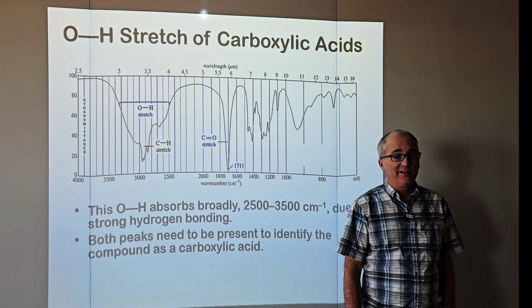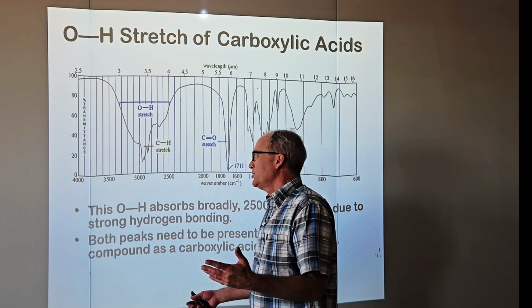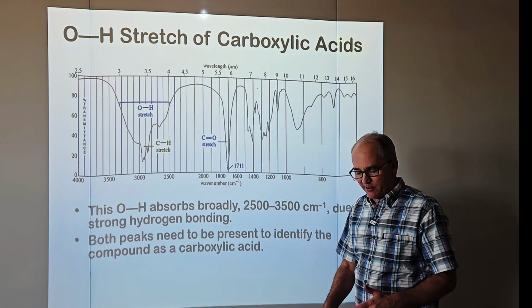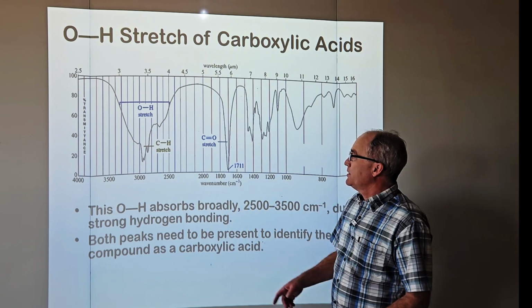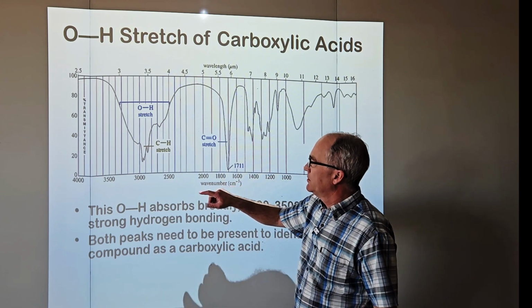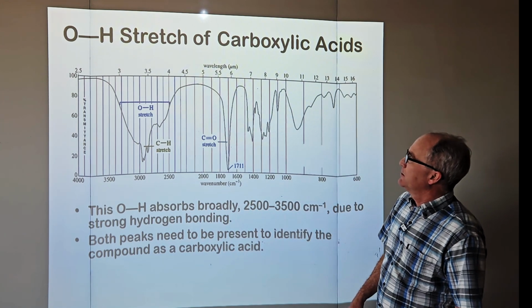How do you tell if you have an alkane? The lack of functional groups. Lack of functional groups. Here shortly I'll draw a picture of what I think is just an alkane. Right, so here we see carbonyl carbon, OH stretch. So this is carboxylic acid.